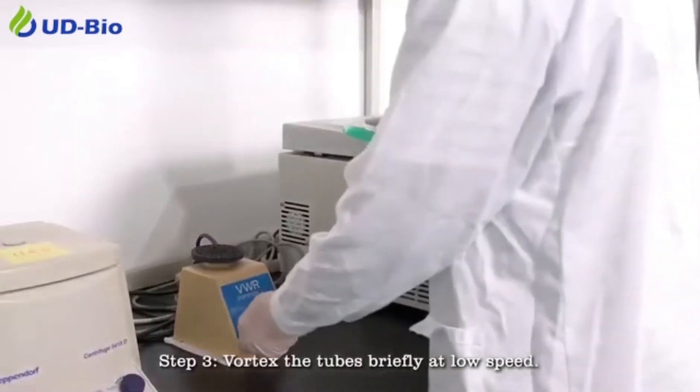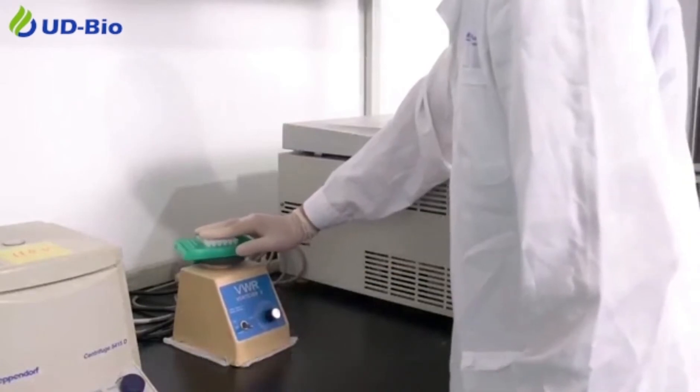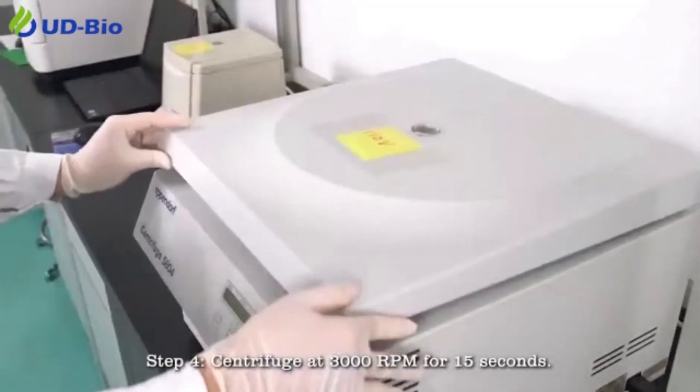Step 3: Vortex the tubes briefly at low speed. Step 4: Centrifuge at 3000 rpm for 15 seconds.